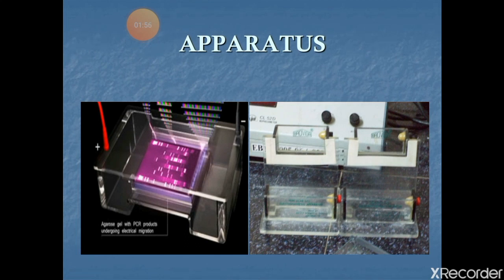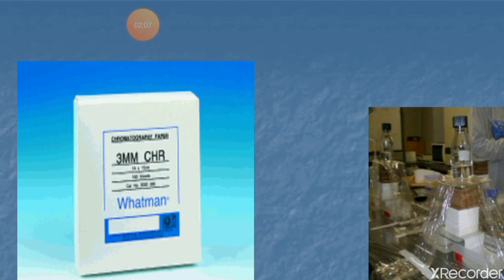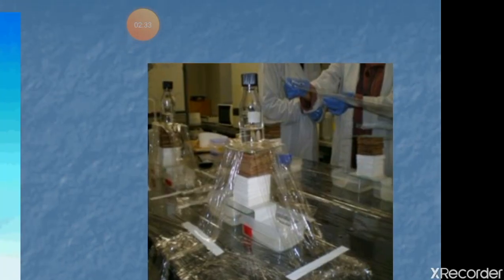In the next step, after separation depending upon their sizes, the DNA is blotted onto a filter paper. This is the paper we are using, Whatman 3mm paper, on which they are blotted. Here you can see the whole apparatus, the lower portion. Here is the electrophoresis for the separation of DNA depending on size, and here the filter paper is kept for the blotting where it is being transferred. This bottle is kept for the weight, and you can also see the nitrocellulose membrane onto which it is blotted.